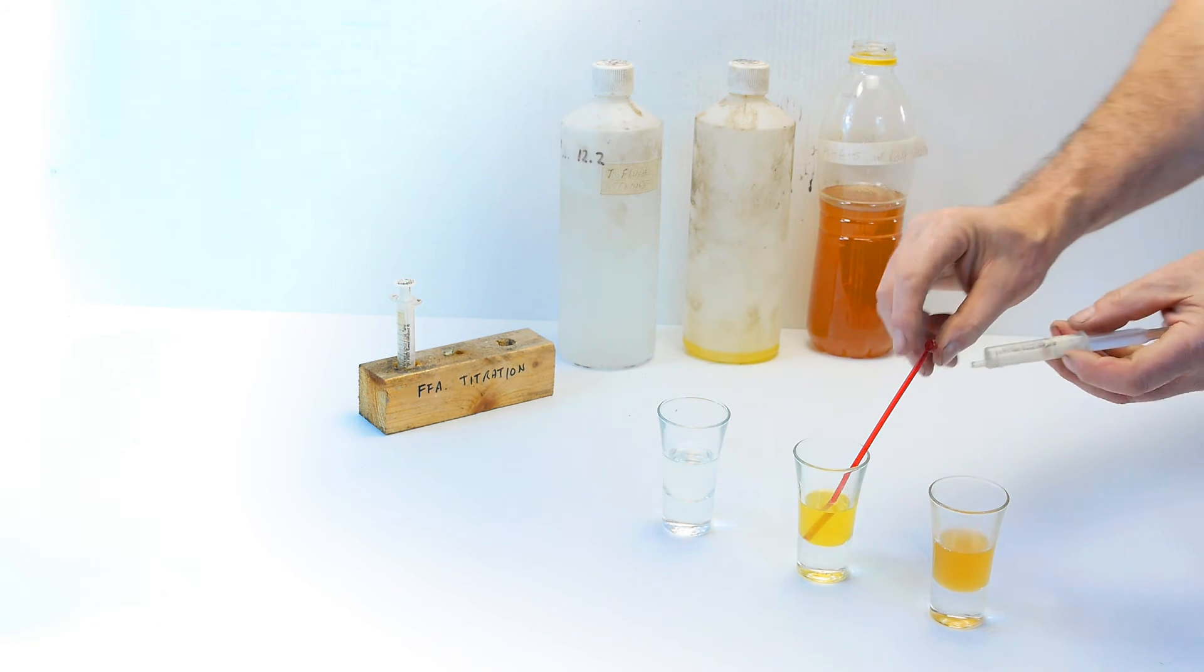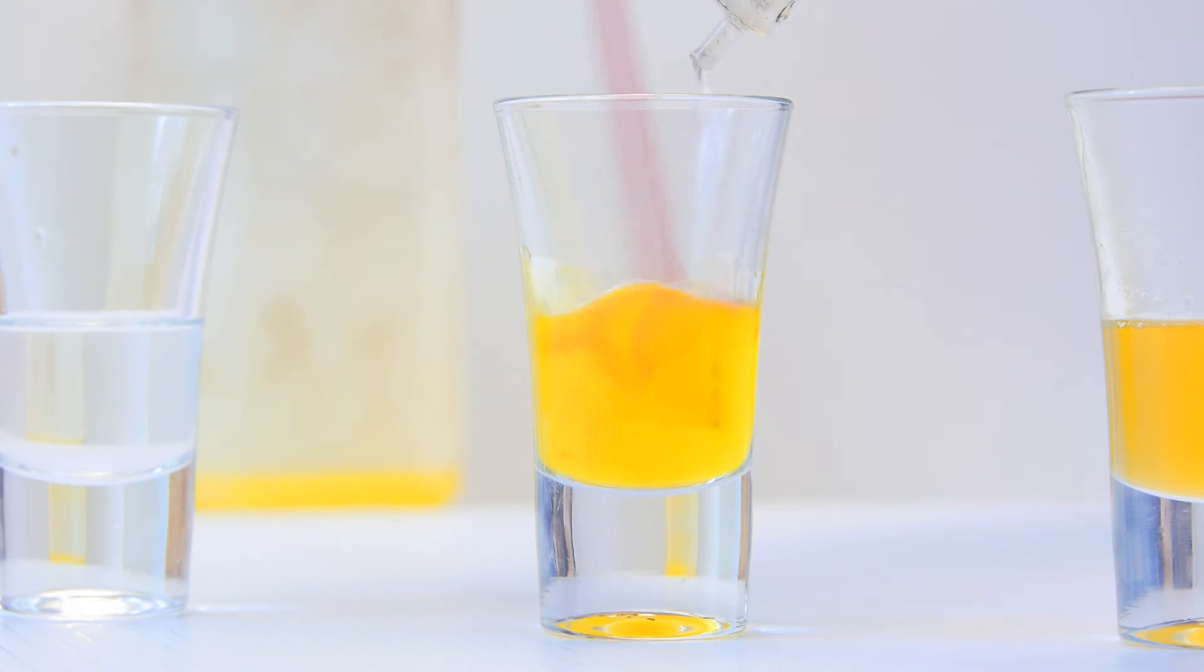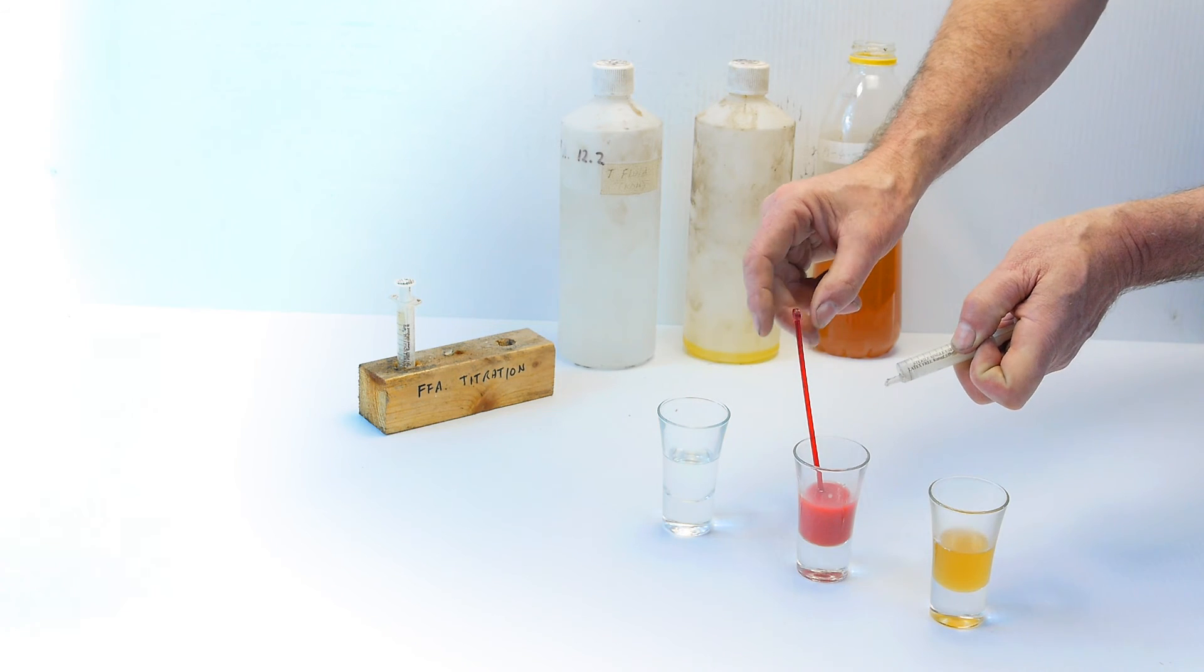Now, drip in the titration fluid, drop by drop, stirring all the time. You will see little flashes or splashes of red occur. Keep going until you see a deep red or a deep pink color. Not orange, not yellow. That is the point at where you stop.